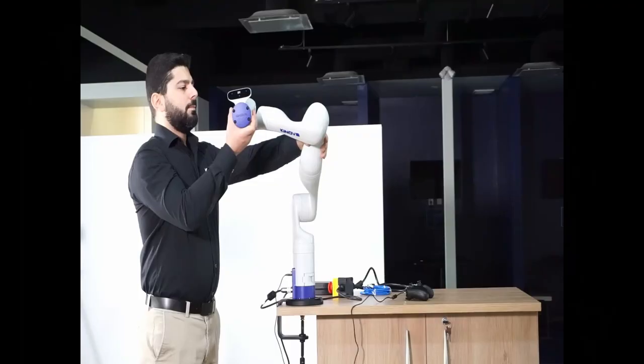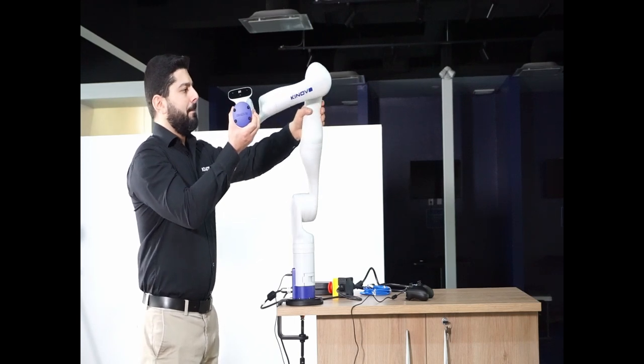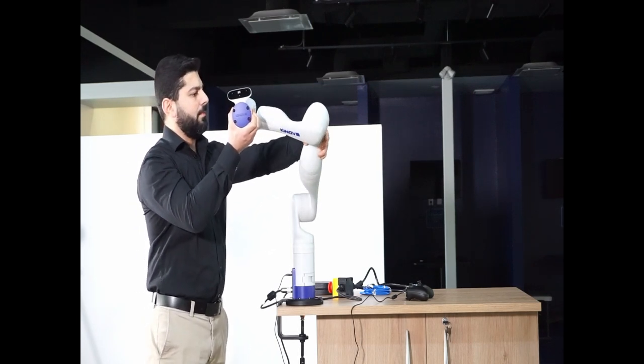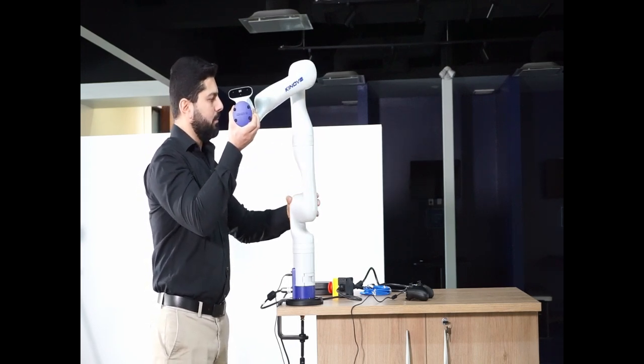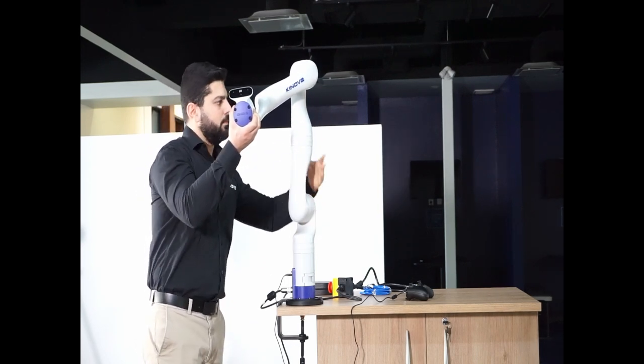For a 6 degrees of freedom robotic arm, you will activate the Cartesian hand guiding mode by pushing and holding the right side button and the joint hand guiding mode by pushing and holding the left button. The null space admittance mode doesn't exist.